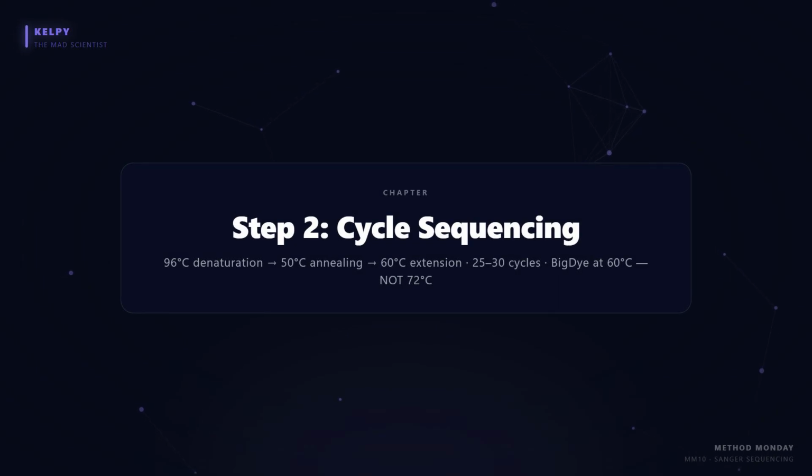Step 2. Cycle sequencing. 96 for 1 minute initial denaturation, then 25 to 30 cycles of 96 for 10 seconds, annealing at 50 for 5 seconds, extension at 60 for 4 minutes. The extension is at 60, not 72. BigDye polymerase is not Taq. Running it hotter does not make it faster, it makes it wrong.